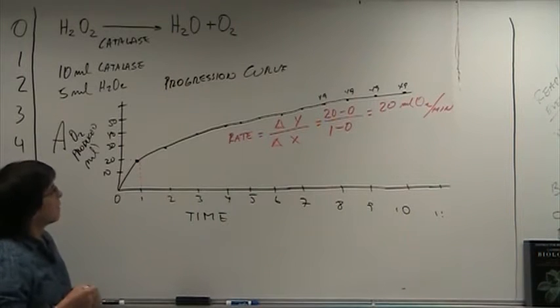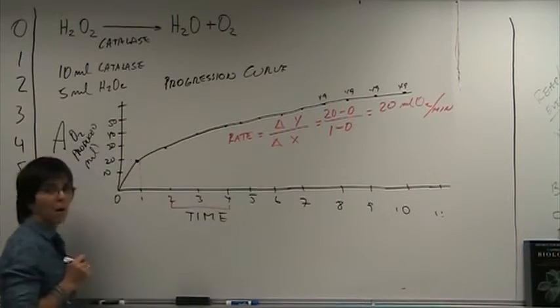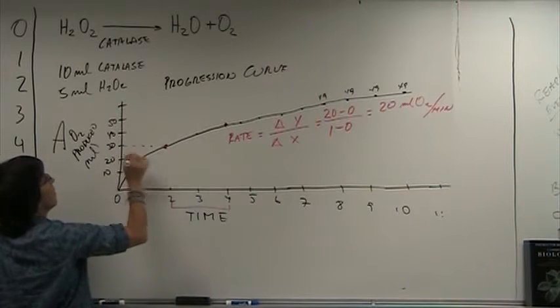If I ask you, for example, to calculate the reaction rate between minute 2 and minute 4, what do you have? Here is minute 2, here is minute 4.